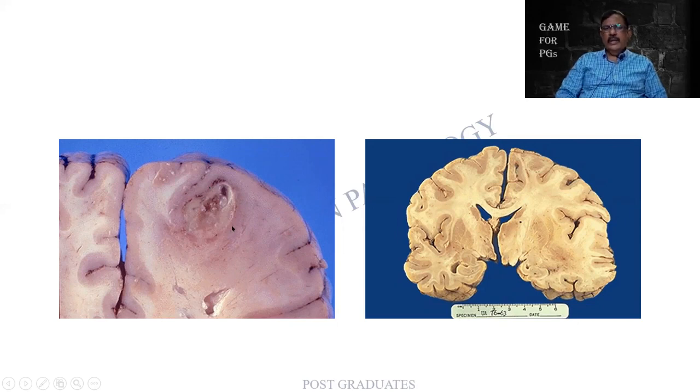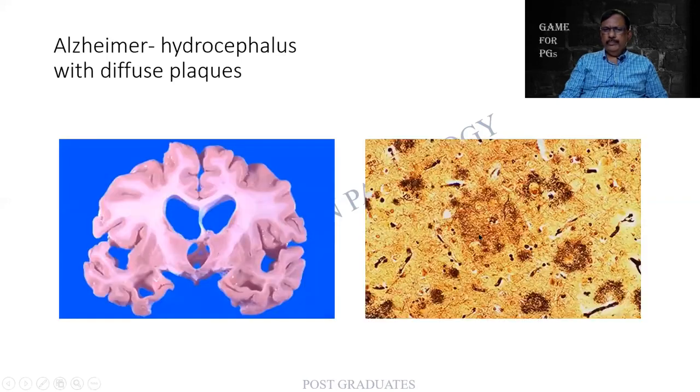This again is a blessing in disguise, the best of the worst, because there is no surrounding fibrosis which pulls the parenchyma. I find a well circumscribed lesion, that is a brain abscess. Sometimes there can be multiple petechial areas of hemorrhage which can be indicative of emboli or thromboemboli.